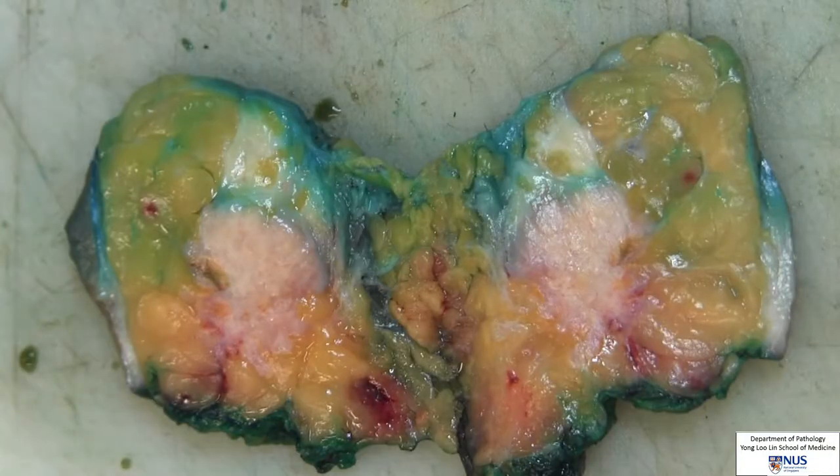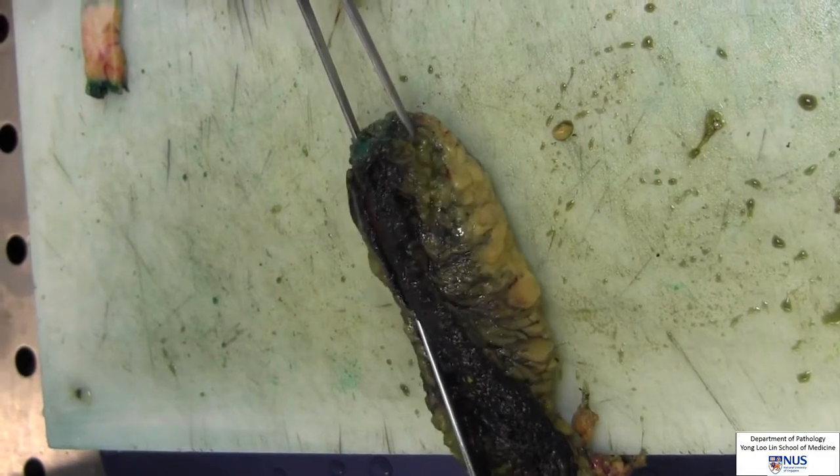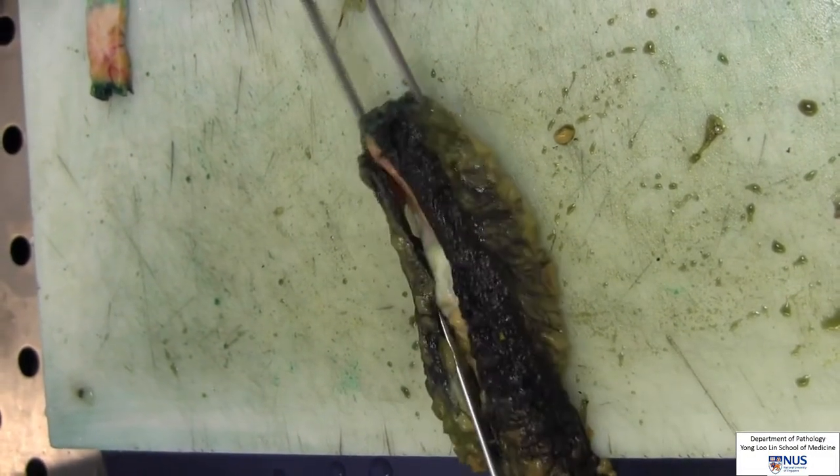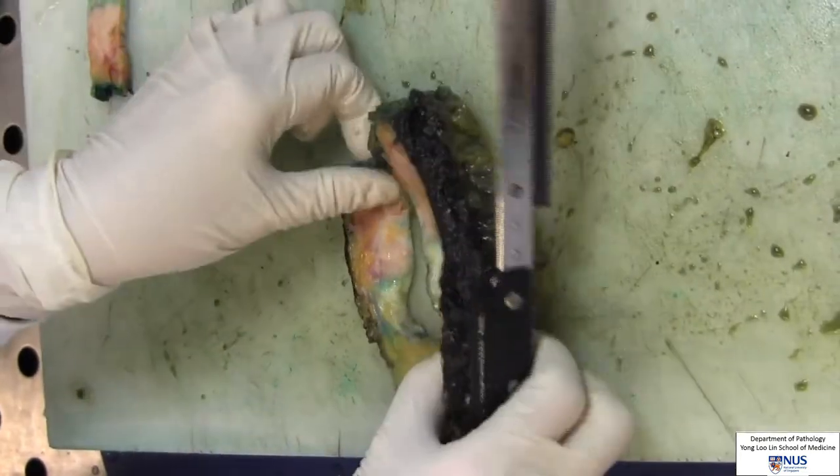We will examine the slice of breast with the tumor closest to the margins. To orientate, the anterior margin covered by skin, superior margin inked green, and inferior margin inked yellow. We will take sections of the tumor with adjacent normal breast tissue at the superior and posterior margins. This is an example of how the tumor will be sampled with the posterior margin. The same process will be repeated for the superior margin.